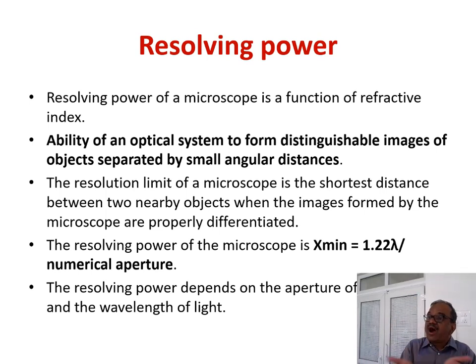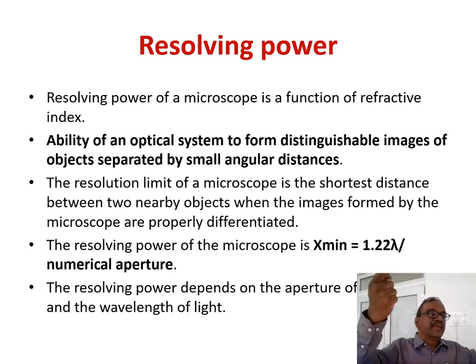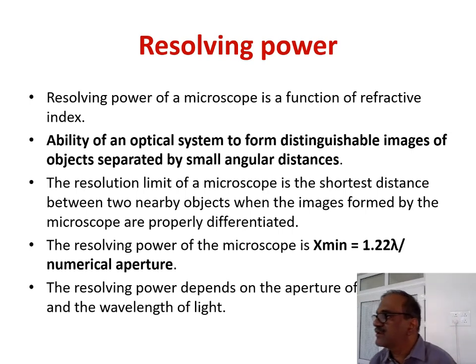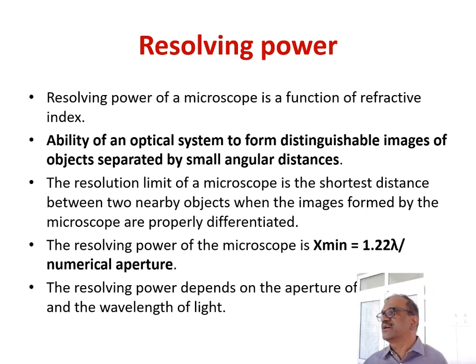So how well you are able to resolve the distance between the two dots with the help of the particular refractive index, that is the resolution. Magnification is different from resolution. Magnification just increases the size of the image, whereas resolving power is, if there are two objects close by, how well you are able to distinguish the distance between the two objects.